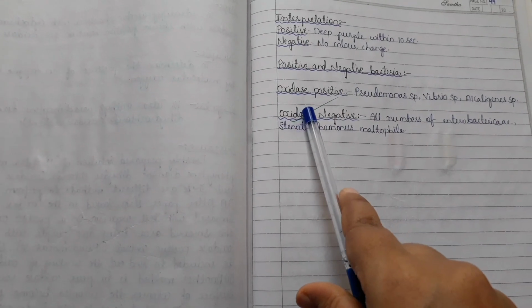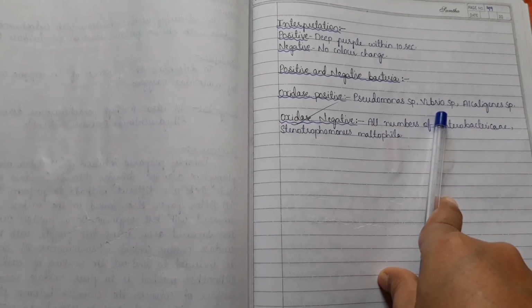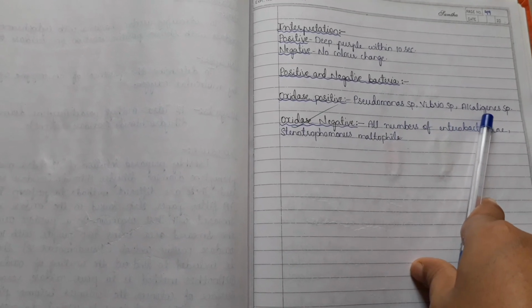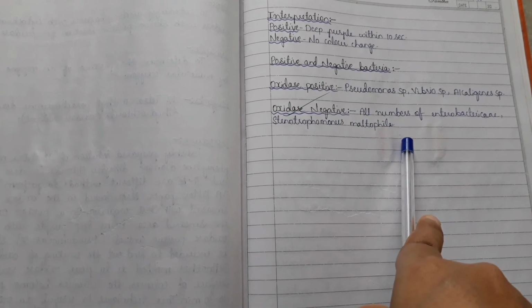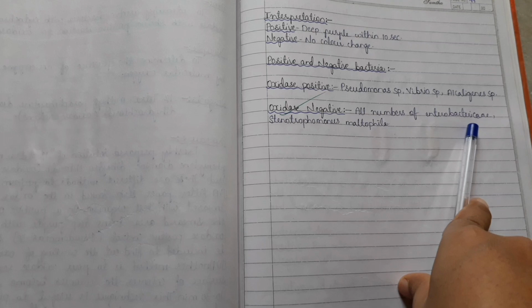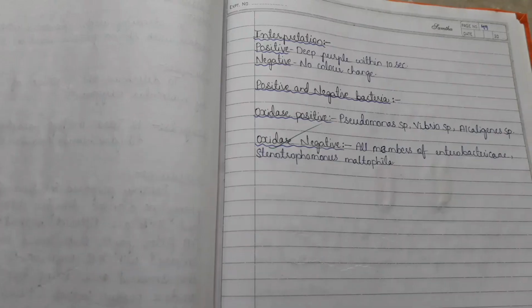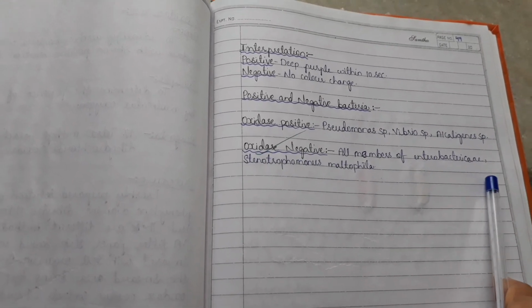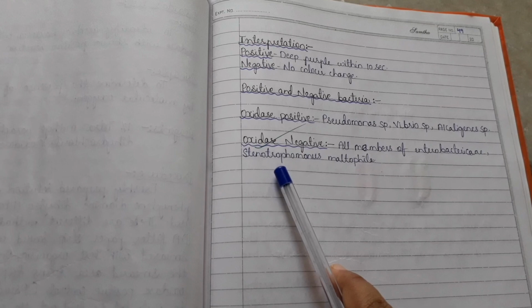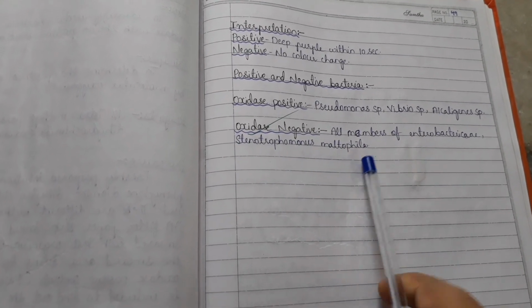Oxidase positive are all species of Pseudomonas, Vibrio species and Alcaligenes species. Oxidase negative are all members of Enterobacteriaceae and Stenotrophomonas maltophilia.